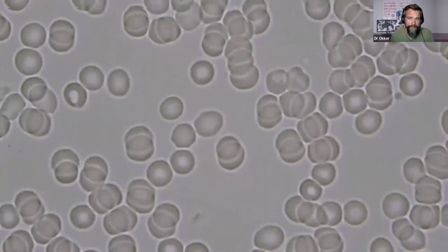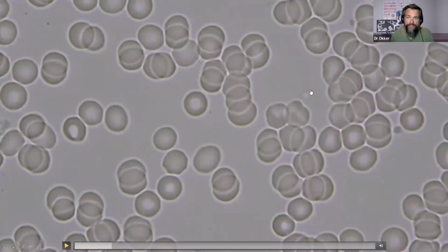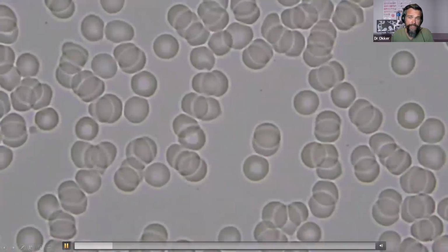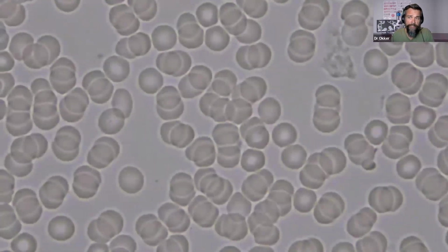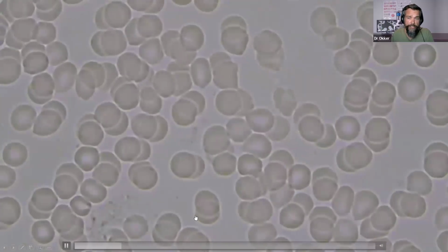Also still some thrombocytes sticking together, and then quite a few areas showing these white spots. So we can see a white spot toward the right-hand side of the screen there, and that's quite a significant finding in this sample. We'll see quite a few of those showing up as we go through the sample. The white spots forming in the plasma. There's also one on top of the red blood cell there. Those white spots all relate to fermentation, indicating a bit of candida.